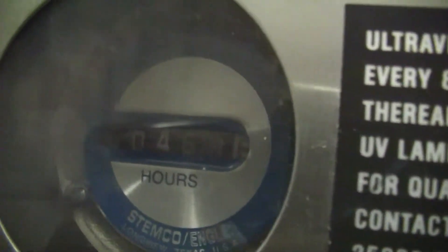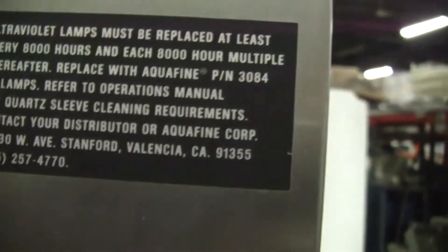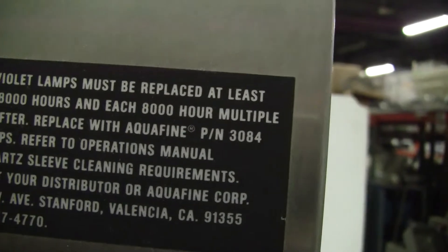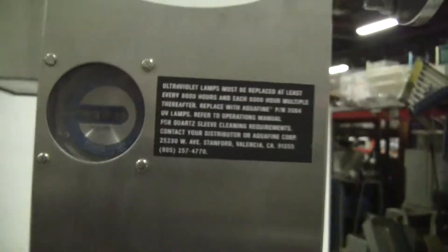There's the amount of hours it has on it — 468, as opposed to 8,000 hours for light replacement, so it hasn't been used much.